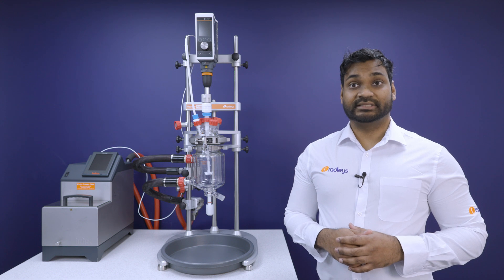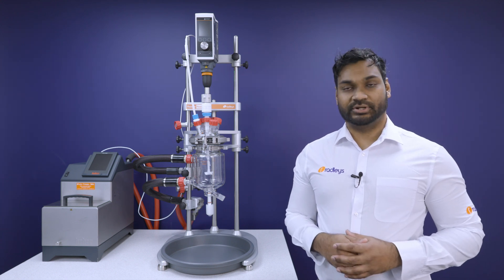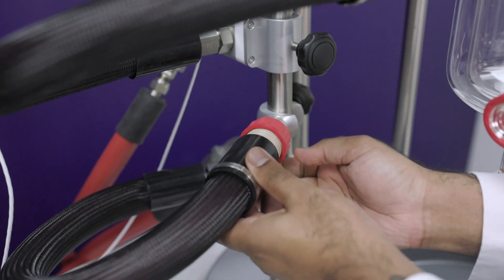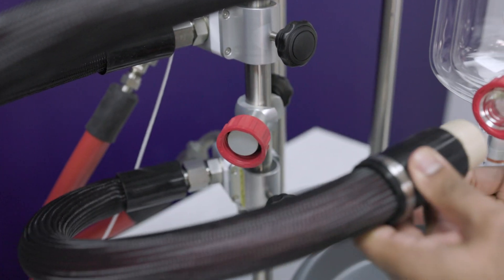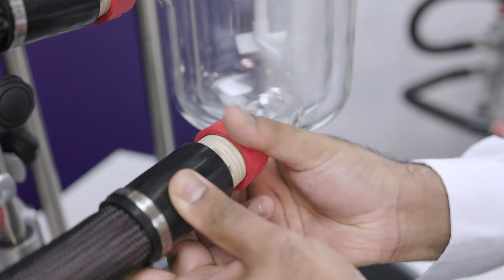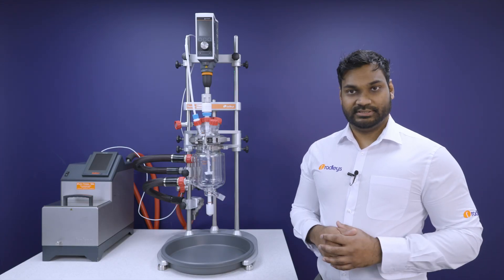We know that temperature fluctuations can quickly lead to batch failures for many processes, so we take extra steps like attaching side arms at a tangent to the vessel with a large bore size to ensure excellent flow of the thermal fluid around the jacket of the vessel. This eliminates the risk of hot spots.